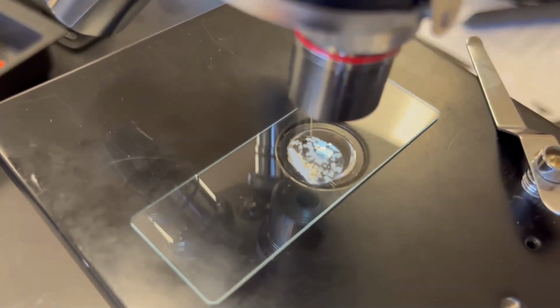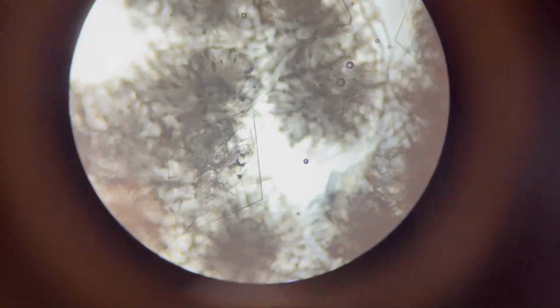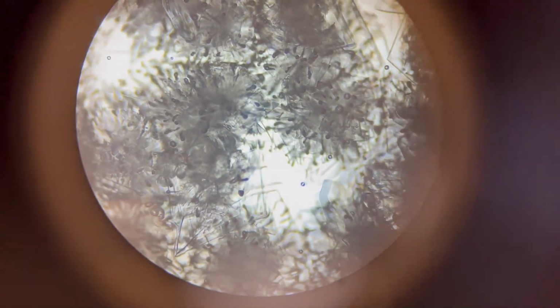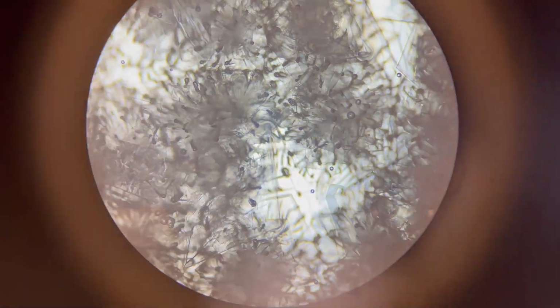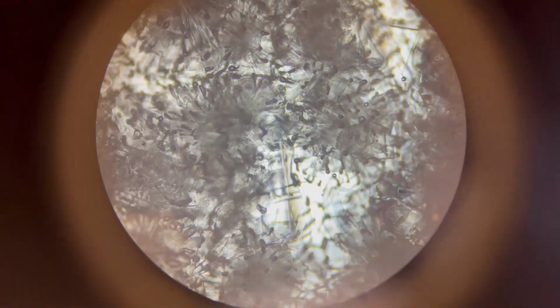For the cold, it literally starts crystallizing as soon as they get back to their seat, and they're going to have to get it focused pretty quickly. But they can pay attention to the difference in the size of the crystals compared to the warm and the cold, the speed of the crystals, and then there are some questions that they're going to answer when they're done with their drawings.